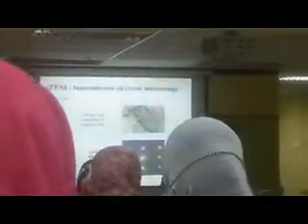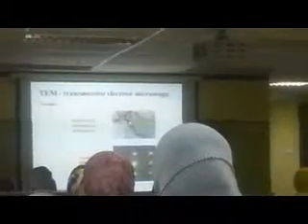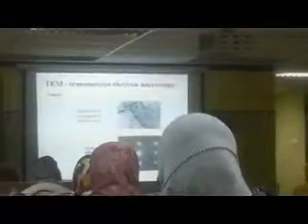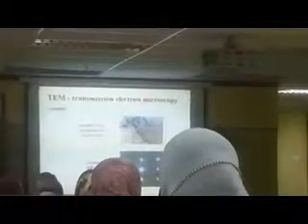And lastly, diffraction. I was talking about electron diffraction. For example, if I have an image like this, we have plates. We have two phases, phase 1 and phase 2. Now I want to do the diffraction of this phase. I want to do the diffraction of this phase. I can focus my beam here and diffract it. I can focus my beam between the grains. I can diffract, and I can get the crystal structure of this phase separately, this phase separately. That's why it is called selected area diffraction, SAD.